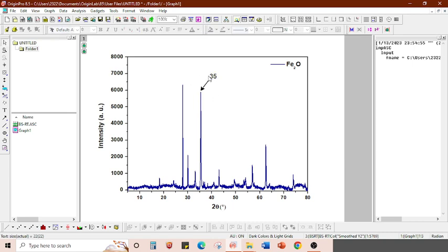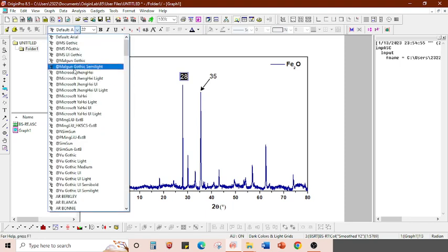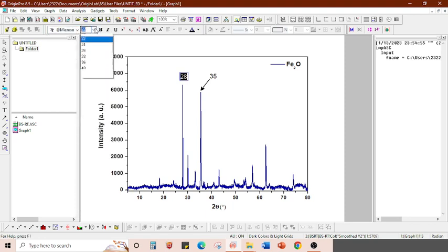So similarly, you can add multiple text boxes anywhere, and then this is around 28, 29. You can also change the font of this by double clicking it. So any text box font can be double clicked, Control A to select, and then you can change the font, different font, or the font size can be modified accordingly. When you want to undo it, you can just click Control Z, it will undo.